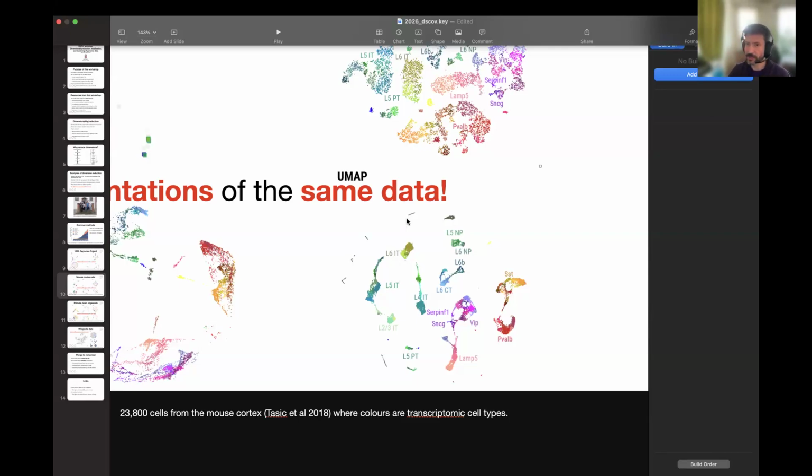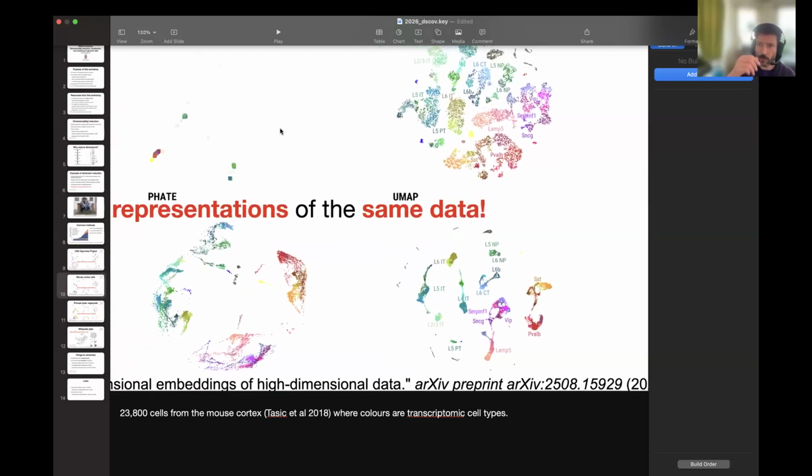But in terms of its strengths compared to a method like TSNE, TSNE can really only work in 2D, maybe 3D if you're lucky, but I wouldn't recommend it. UMAP can reduce data to an arbitrary number of dimensions. So if you're doing something like clustering, clustering in 2D is unreliable because you lose a lot of really important relationships in the data. You get a lot of artificial tearing. Clustering in like 5 dimensions is a bit better because those relationships are more likely to be preserved. So you can take your data, run it through UMAP, and then put it in like 5 dimensions and then run clustering downstream. And it works really, really well, especially because of this property where the data is a little overly discretized. You can get really strong clustering.